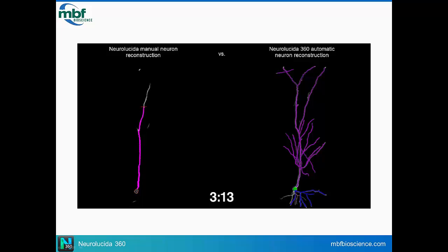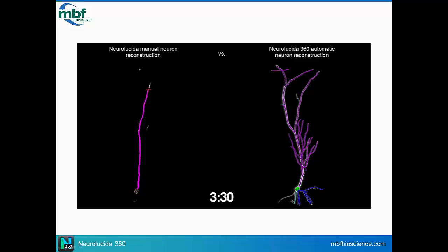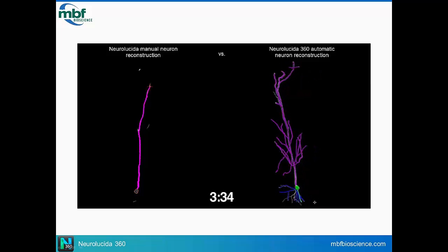And I think, again, we're focusing on more large structures and neurons. Some of the autofluorescence would have more of an issue if you're going to be staining for puncta. But I think in this situation, the minimal autofluorescence can be overcome by changing some of your settings when you're imaging or through the deconvolution process.